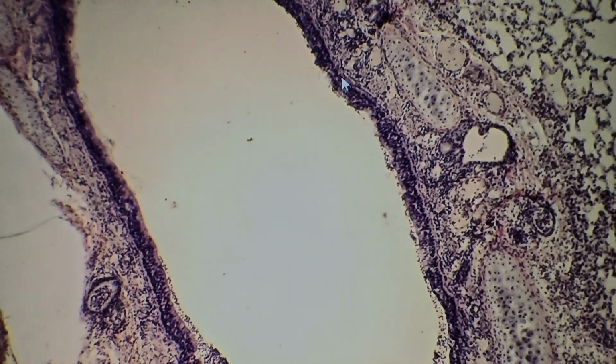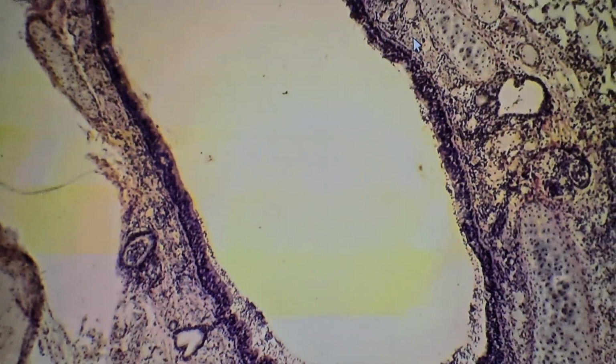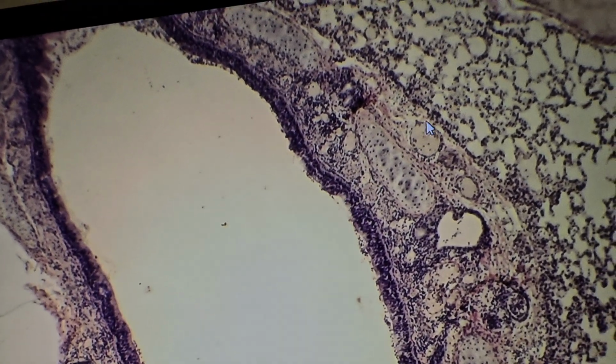This is a bronchus with respiratory epithelium, lamina propria with mucous glands, and isolated plates of hyaline cartilage. This is the wall of the bronchus.